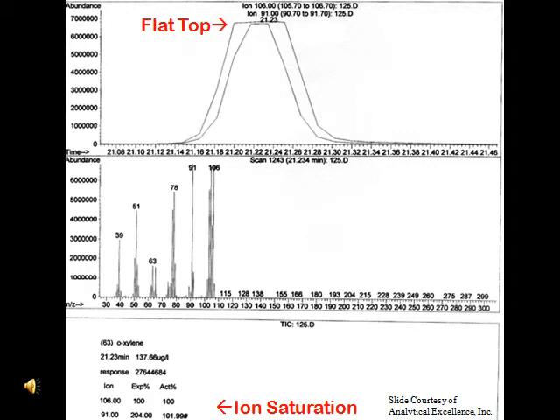Another sign of saturation can be the presence of a flat top peak, as is shown in this example, and again the decline or saturation of the secondary ion compared with the expected percent ratio.